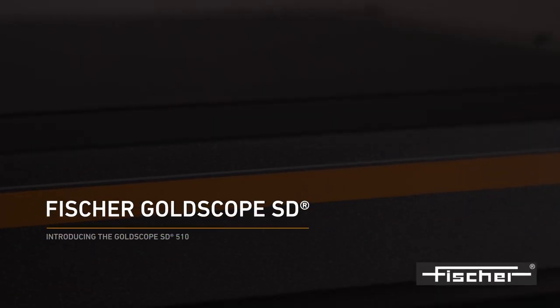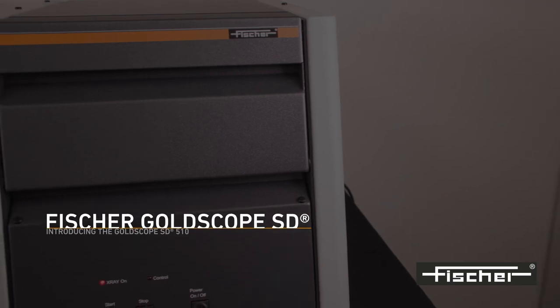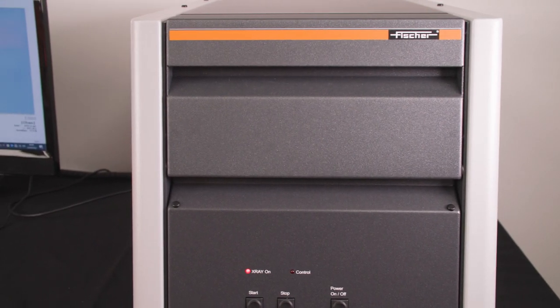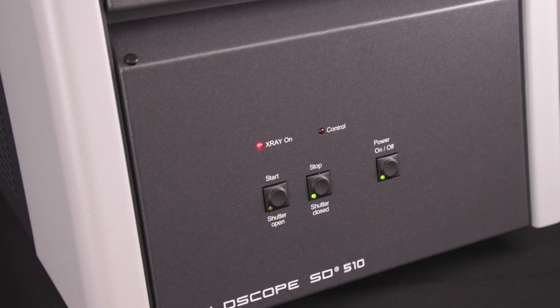Introducing the FischerScope X-Ray GoldScope 510. The FischerScope X-Ray GoldScope 510 is a compact and robust benchtop instrument for fast, cost-effective and non-destructive analysis of jewellery, coins and precious metals.